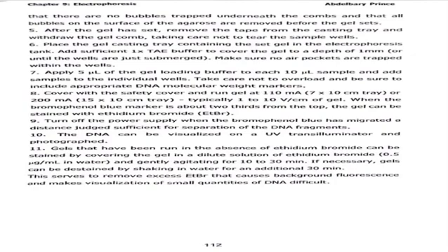9. Turn off the power supply when the bromophenol blue has migrated a distance judged sufficient for separation of the DNA fragments. 10. The DNA can be visualized on a UV transilluminator and photographed.